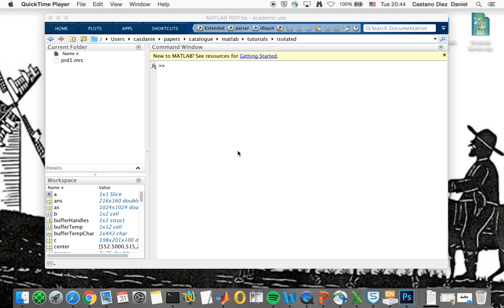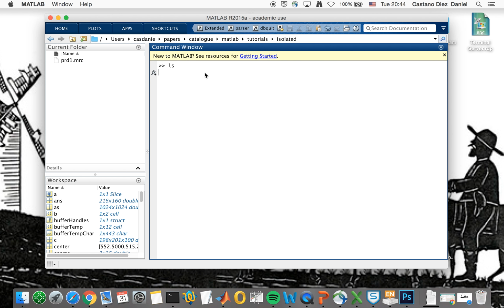Hi, I'm Daniel Castaño and I'm going to show you how to click particles in Dynamo. Now we're going to focus on isolated particles. Let's see what we have here.